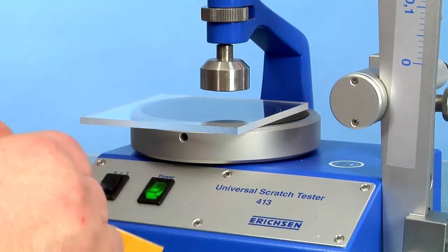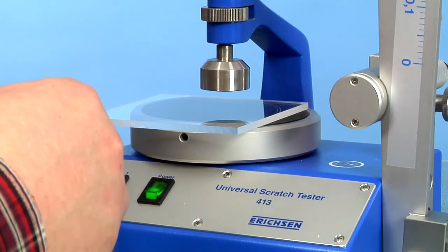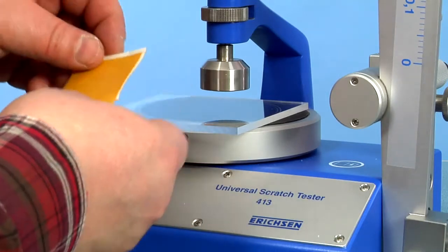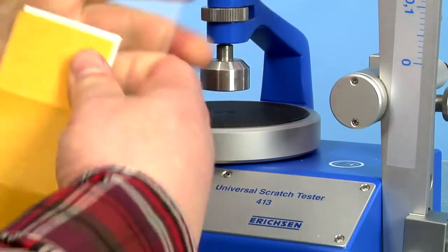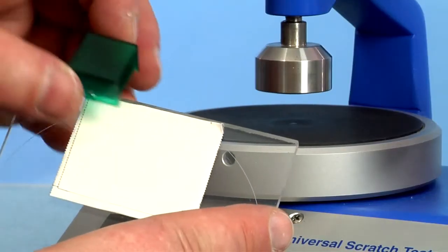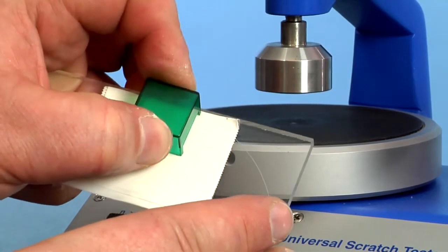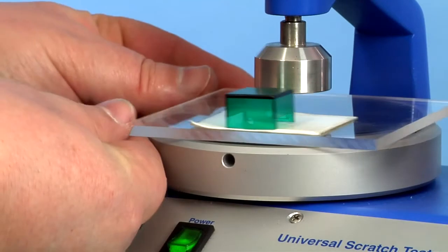This method is also suitable for small samples. Simple fixing of small samples using double-sided adhesive tape. The easily improved sample support plate is fixed quickly and easily by turning the screw.